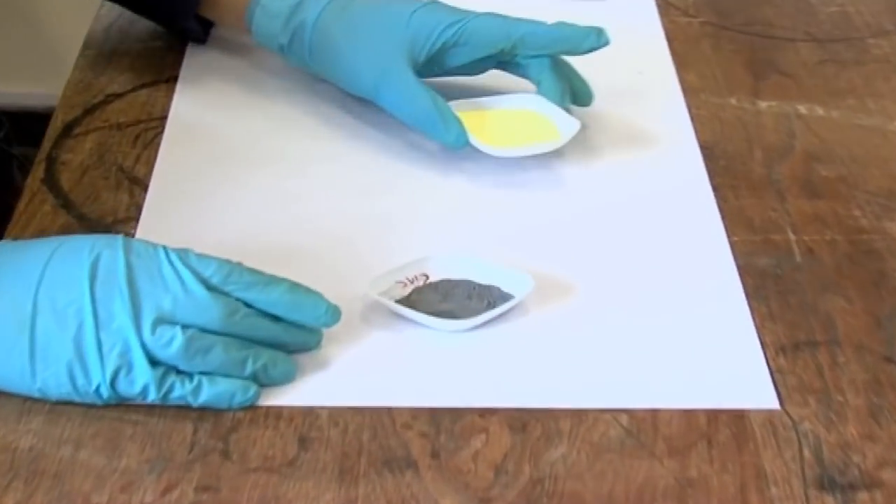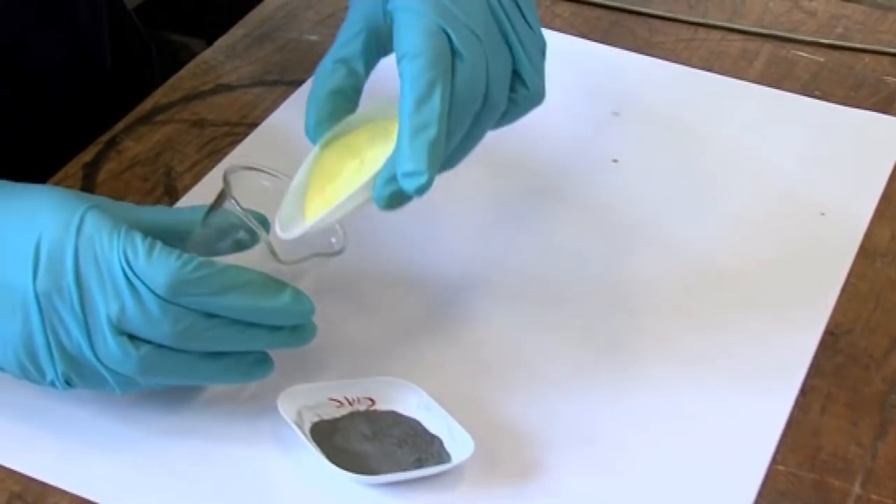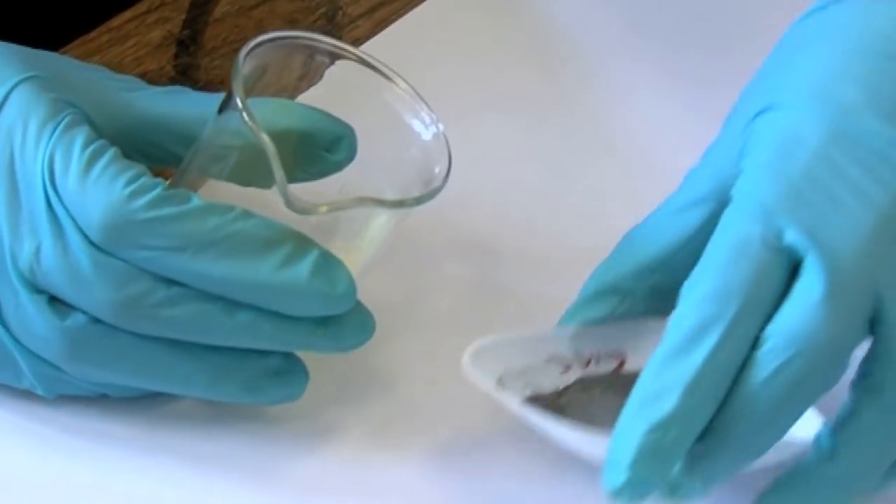So we've got our zinc, which is our grey powdered metal here, and then here's the sulfur. We're going to mix them together just by putting them into a glass beaker so you can see the colours mix.